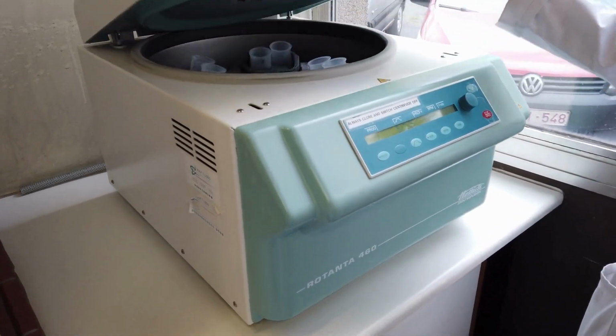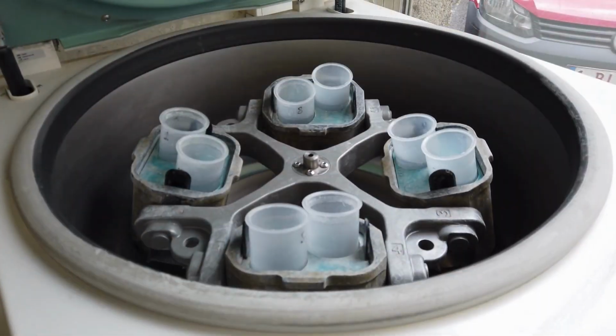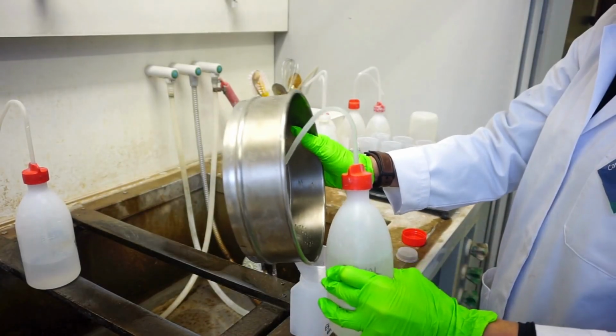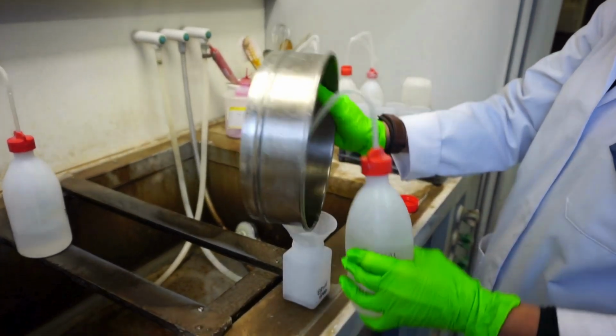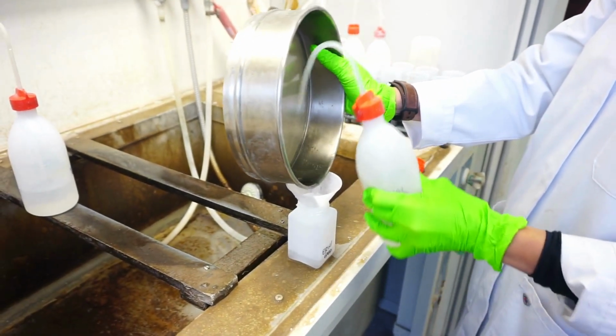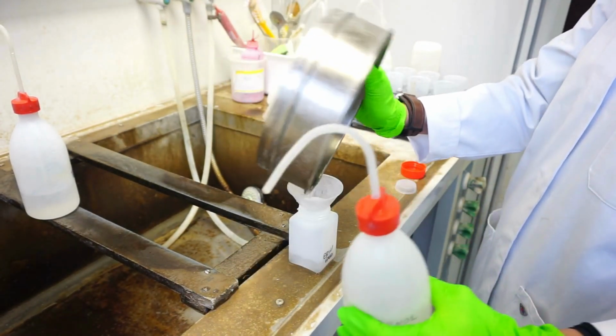The centrifugation process is repeated twice more to extract the majority of organisms. The sediment is homogenized before each centrifugation. Once the last centrifugation is completed and the 3 subsamples are pooled, the meiofauna is transferred to a small recipient with formaldehyde 4% to preserve the specimens.